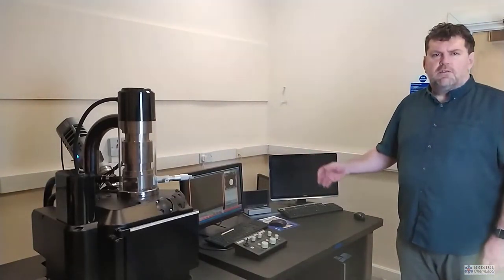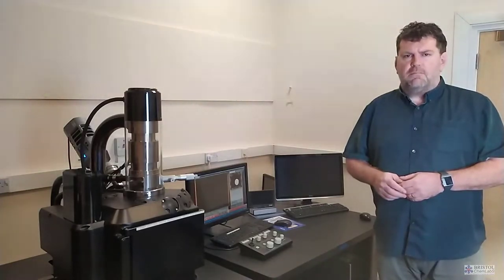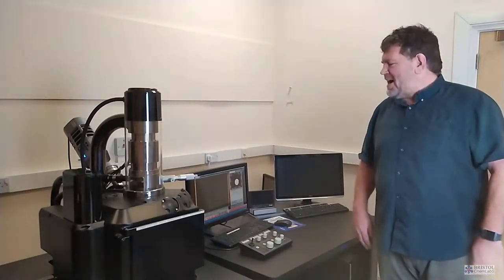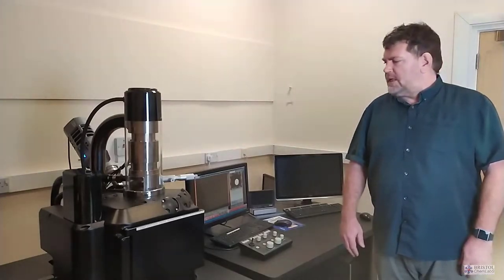We'll start with the scanning electron microscope and I'm actually going to look at some samples that originated from final year undergraduate research projects. These advanced instruments and facilities are available to undergraduate students, principally when they come to do their final year project. They get hands-on training and can characterize their own samples themselves.